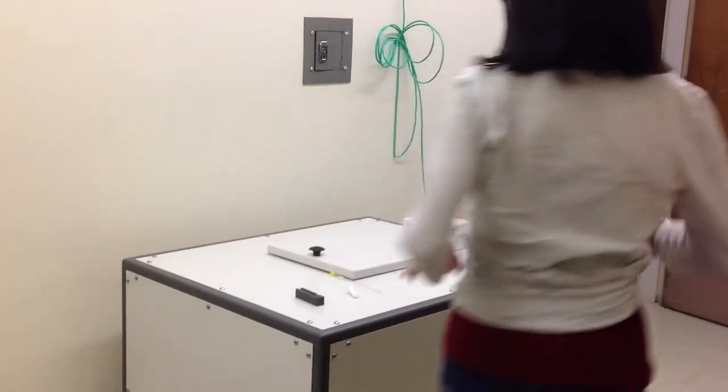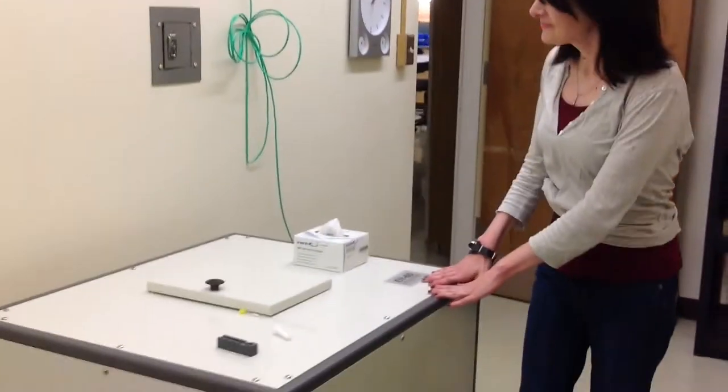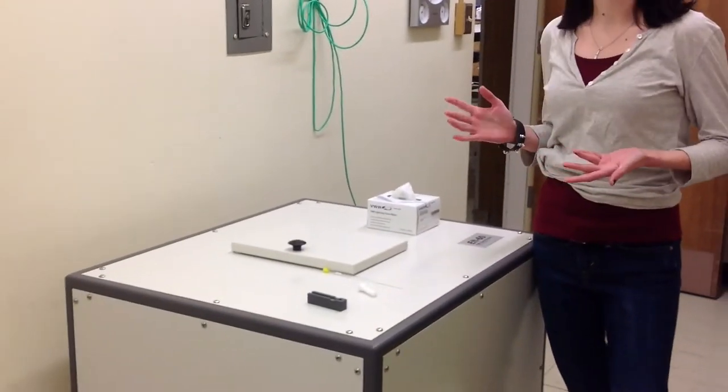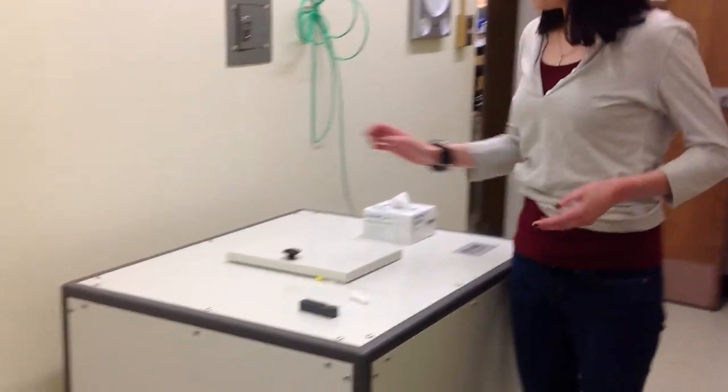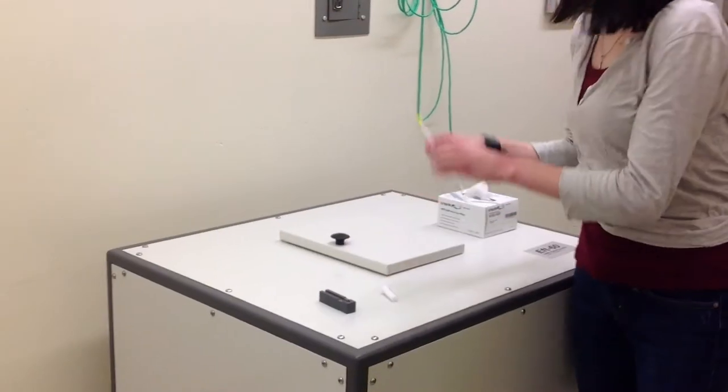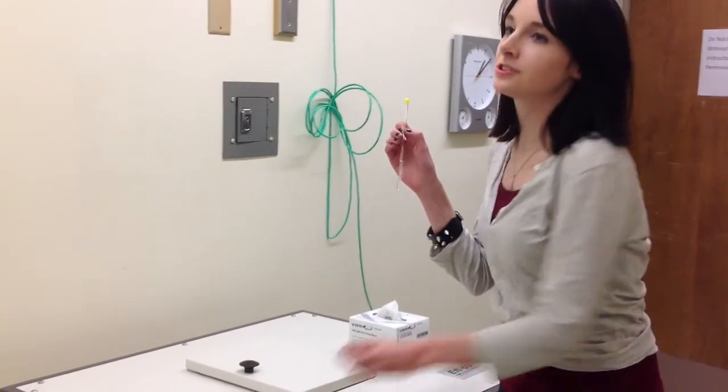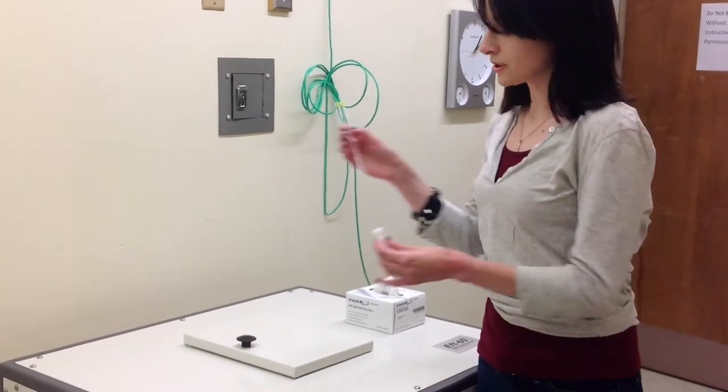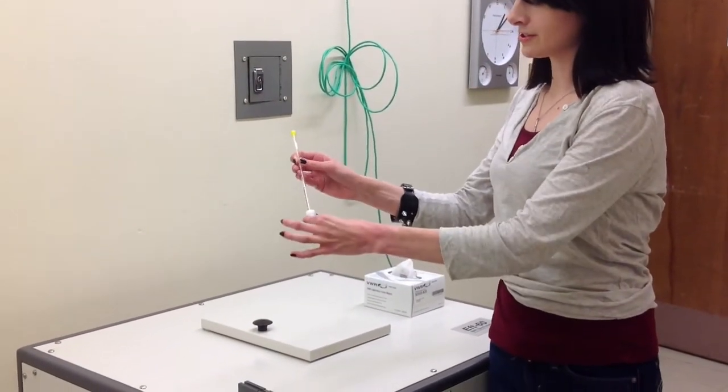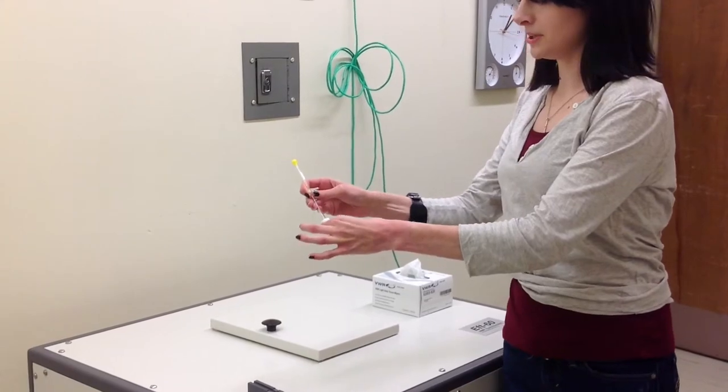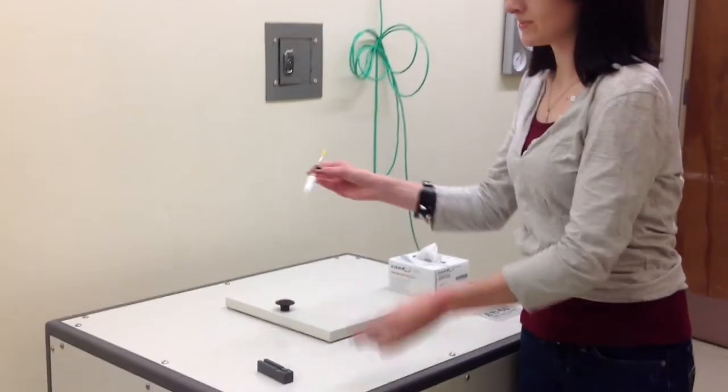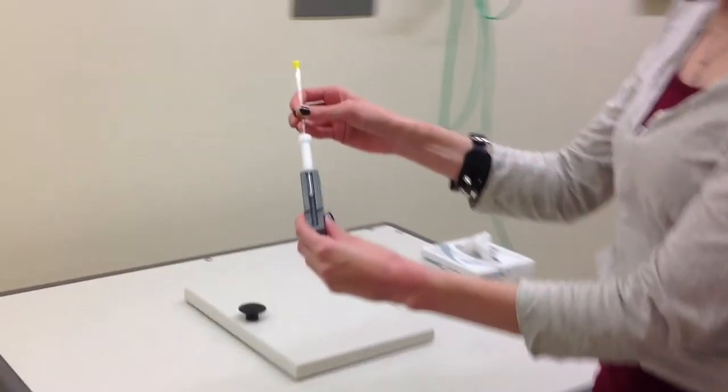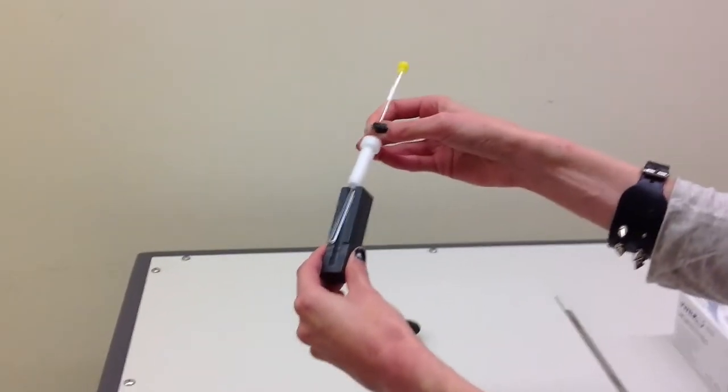Now we can go over to the 60 megahertz NMR and I can show you how to prepare your sample tube. Here's the sample tube and here is your spinner. I'm going to apply the spinner this direction on the tube and then I use the depth gauge to make sure it's placed correctly on the tube.